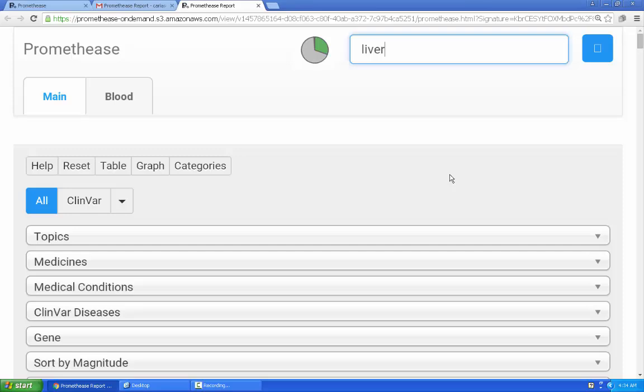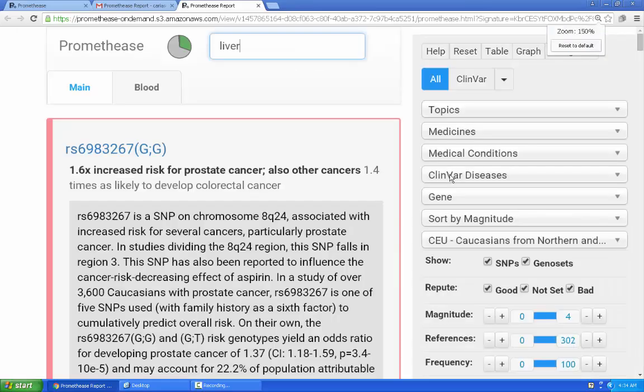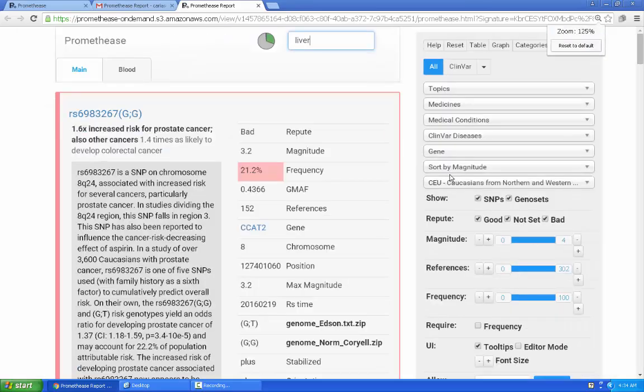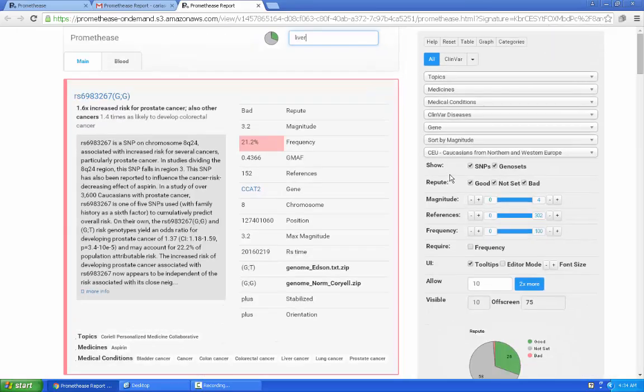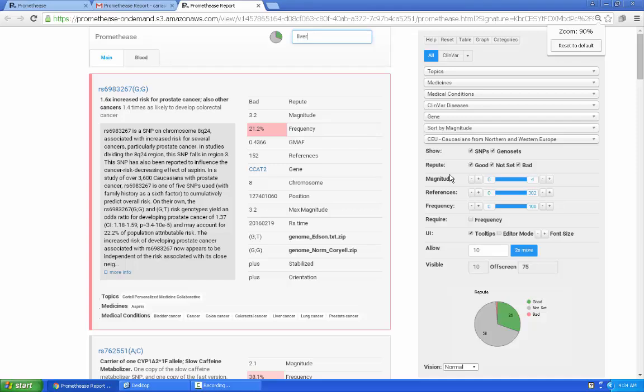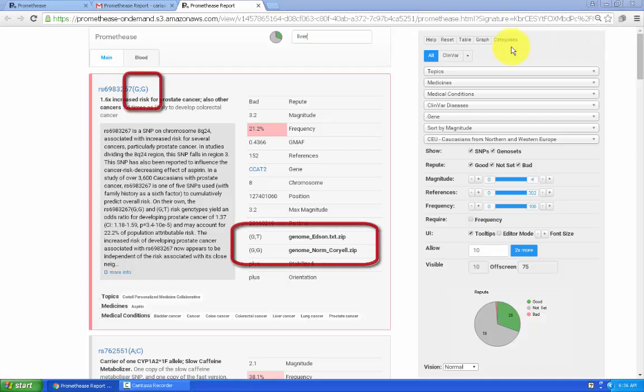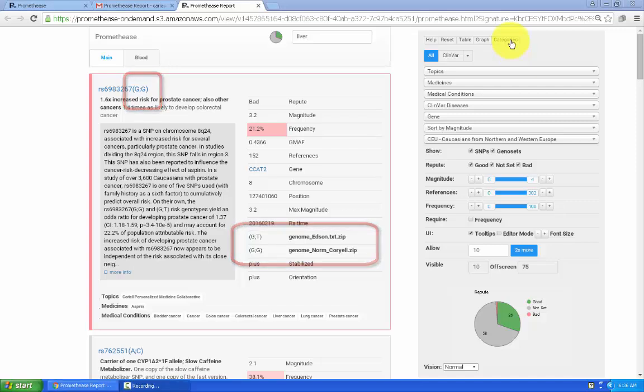By zooming back out to regular desktop size, you can see the pie chart in the lower right. You can also see the genotype for Lily Mandel in the upper left and the two others we want to compare to in the right highlighted in that red circle.